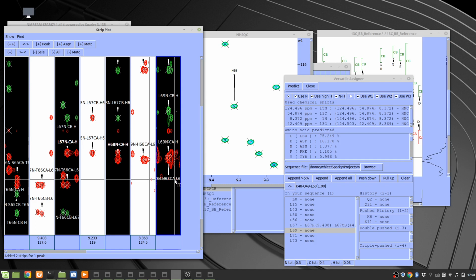So you can do a similar thing for side chains. Like if you have CCONH and HCCONH, solid state NMR data could be assigned in a similar way.